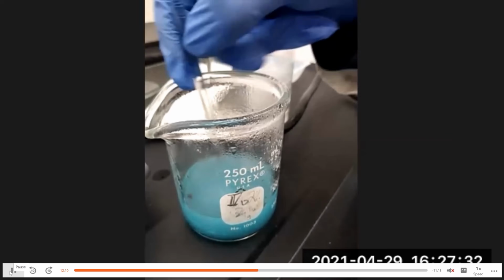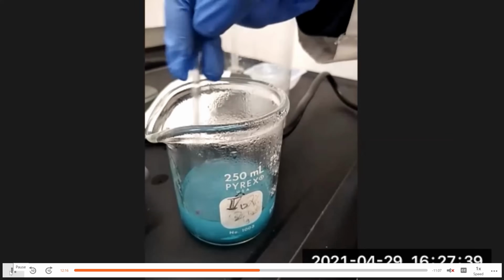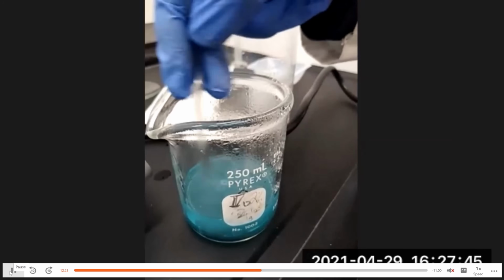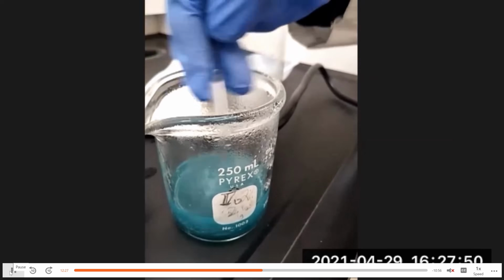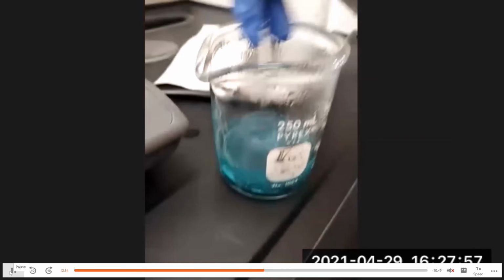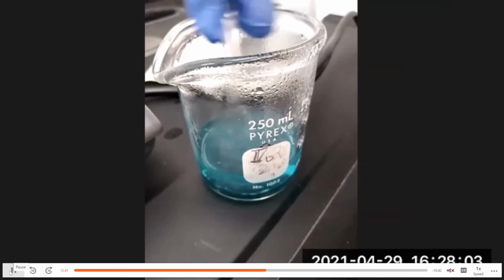So it does take some time for the zinc to completely react. And in the process, you're going to be forming a red-orange precipitate, which is copper. So we're extracting the copper back out of the solution. And as you can see, the blue color is slowly losing intensity as the reaction is progressing. And so this is the single replacement component of this lab.